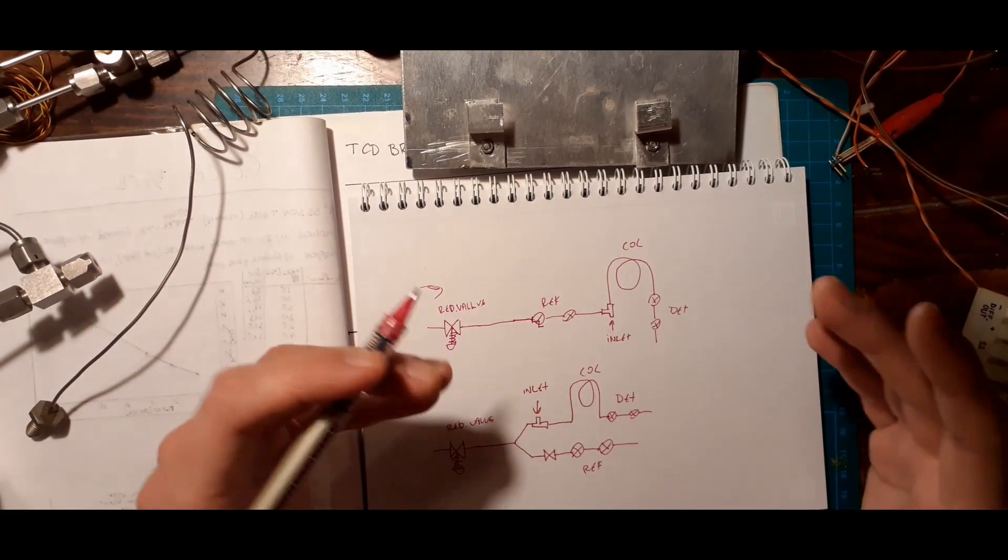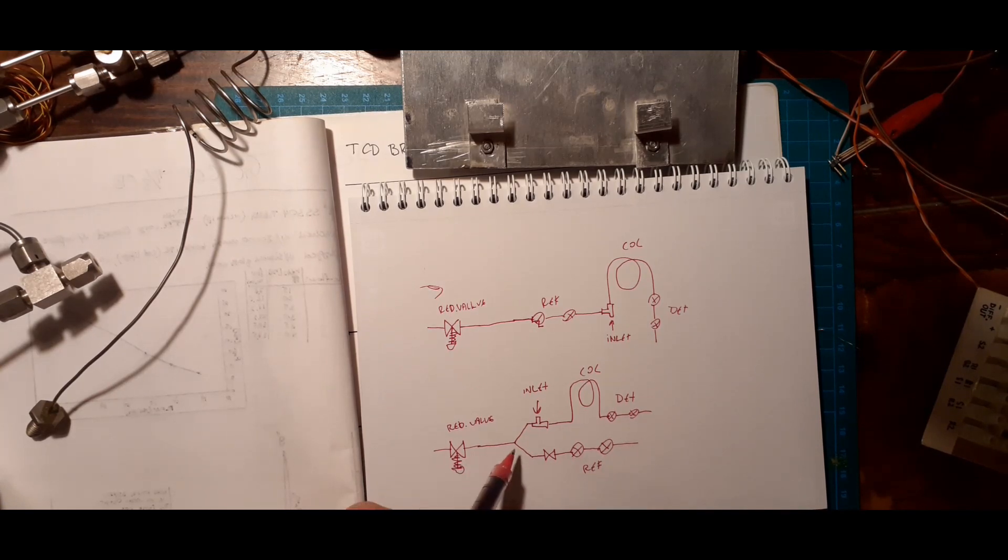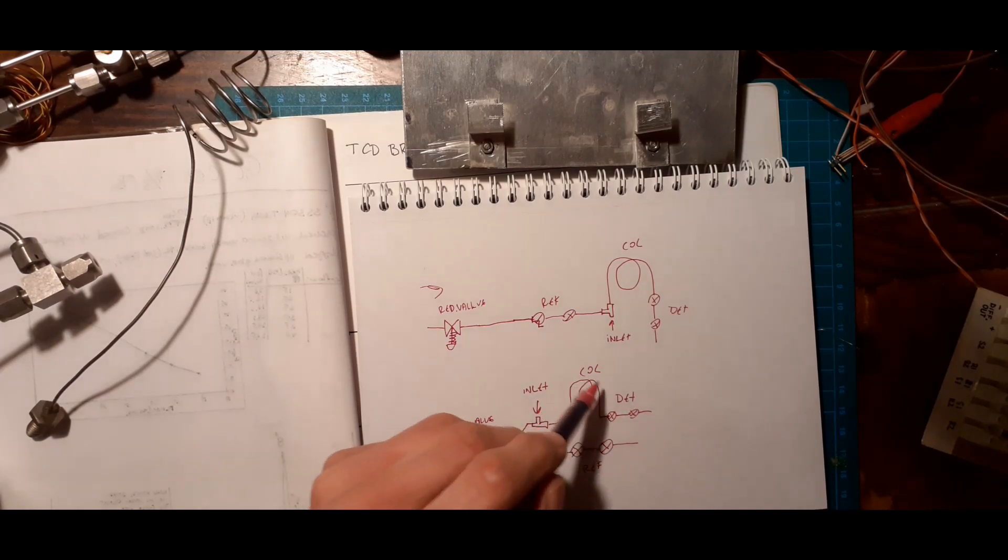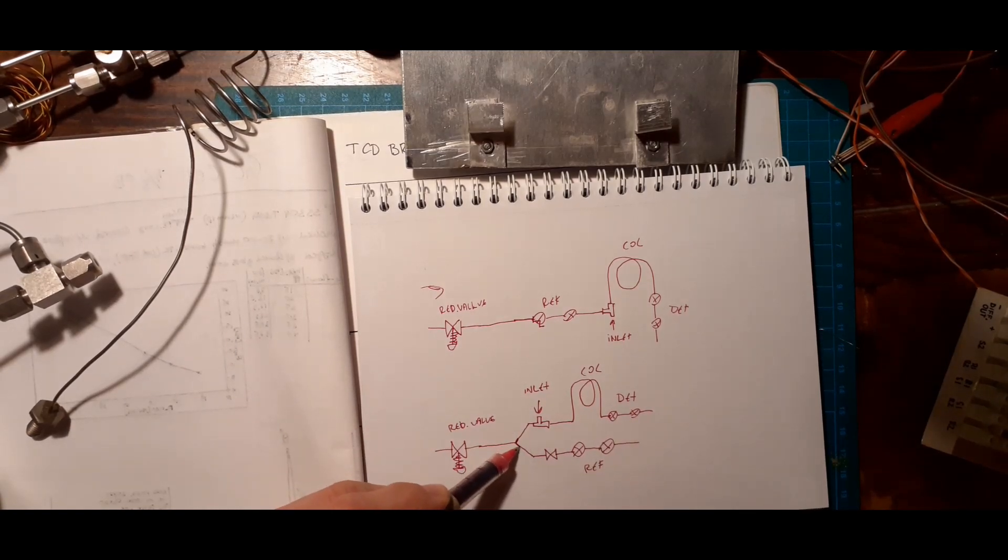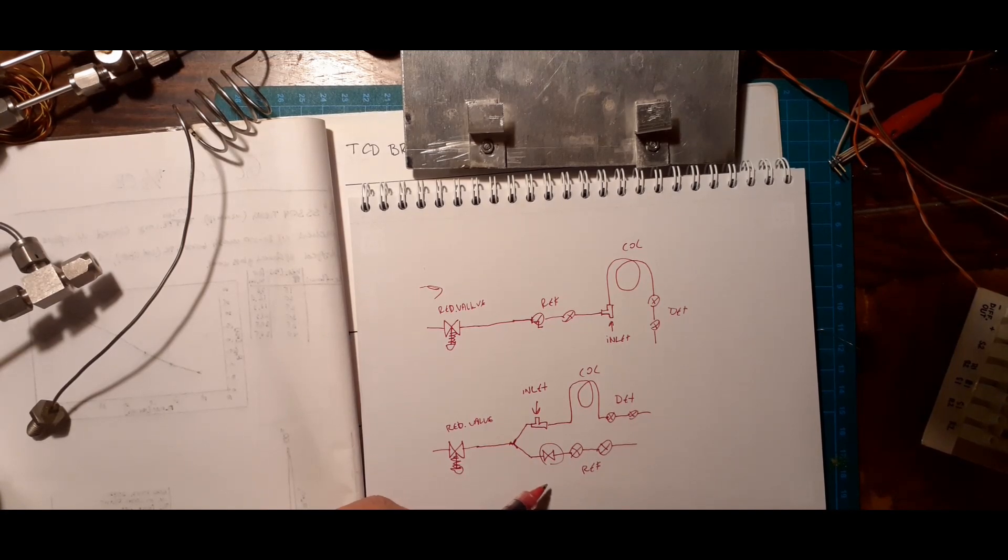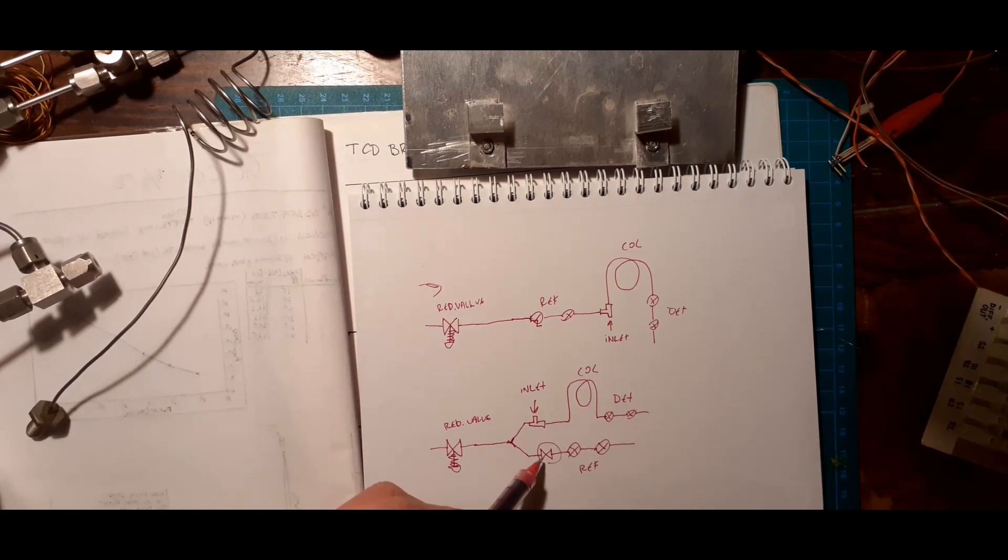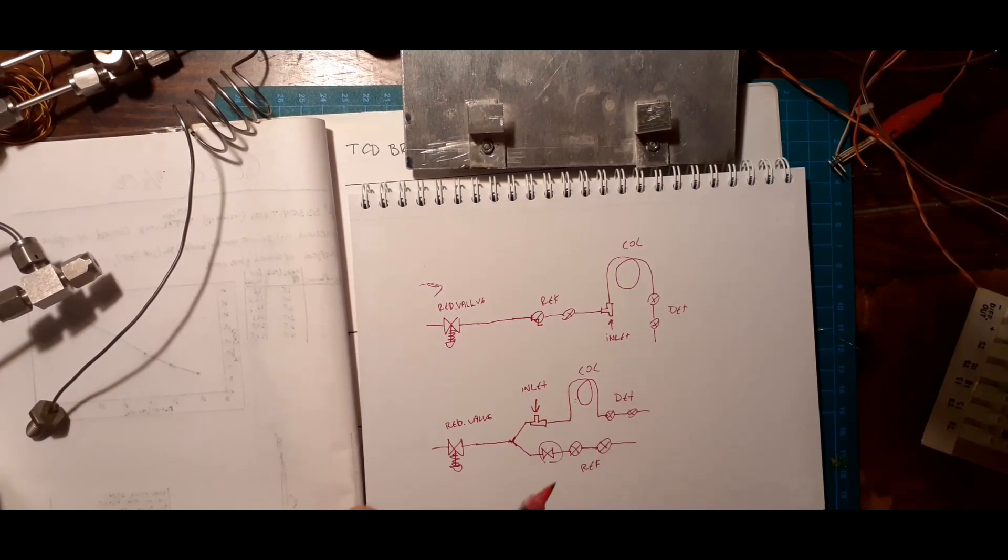Now the other way of doing it, and I've seen this implemented too, is that you can have from your tank pressure, or your reduced tank pressure, your carrier pressure, you can have a split where one side goes to your inlet and your column, and then the detecting side, and then you have this Y-split before here, where the other side goes through some kind of flow restriction, and to the reference side. Ideally this would be an identical column to your column.